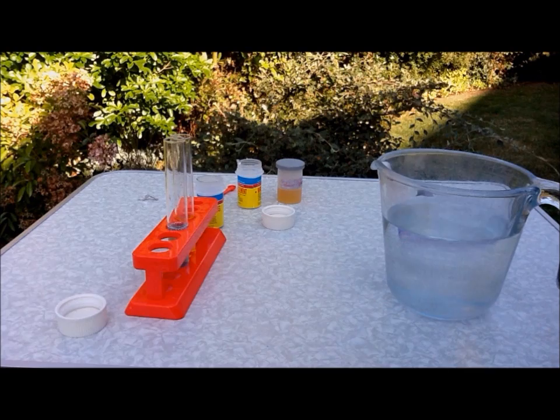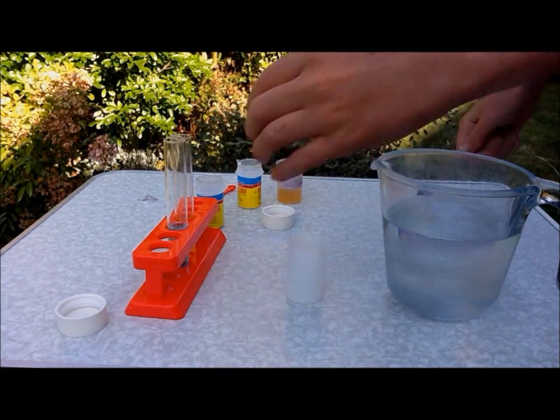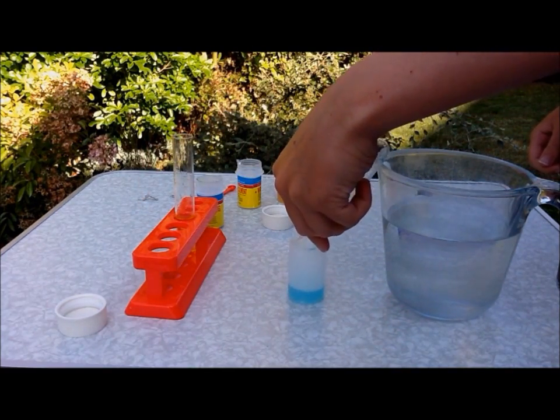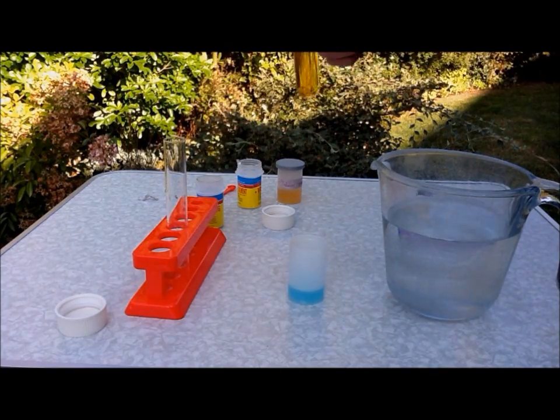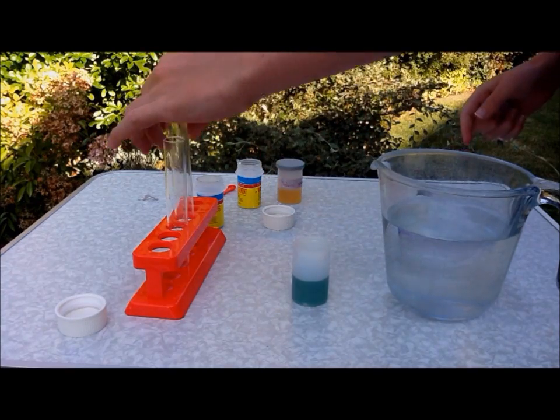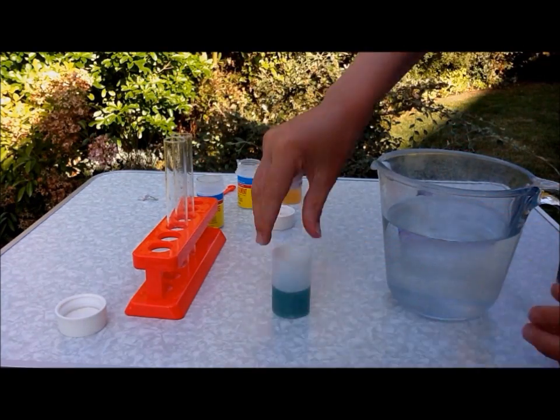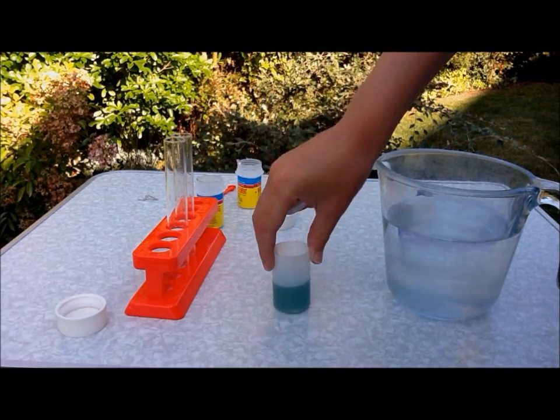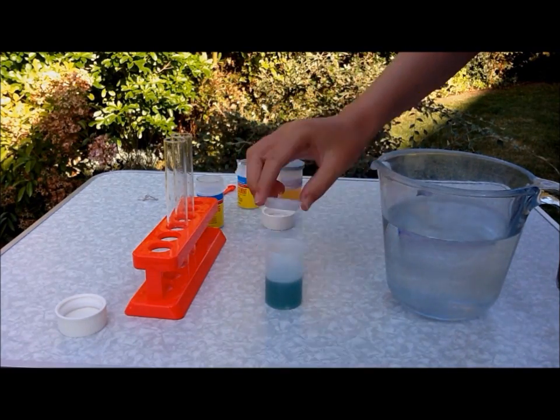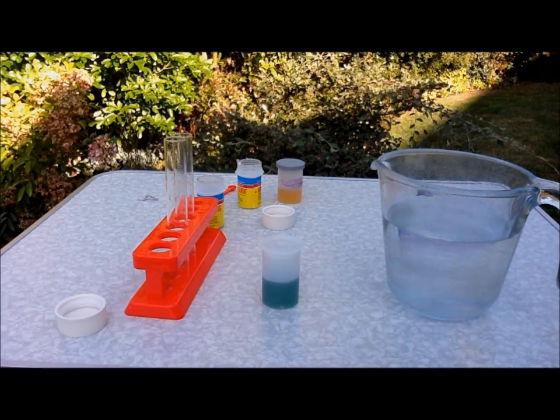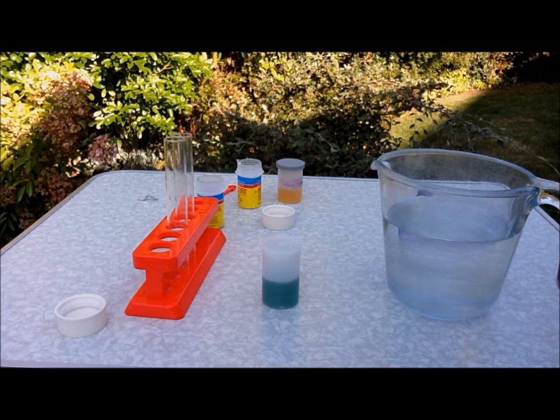Then you need to pour them both in together. Now you have a blue-green Fehling's solution. Then put your cap on it and label it. So that's how you make Fehling's solution.